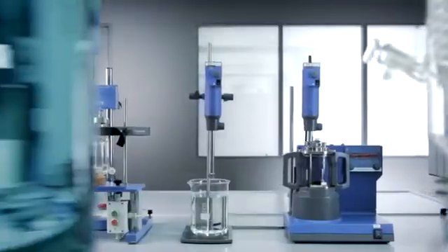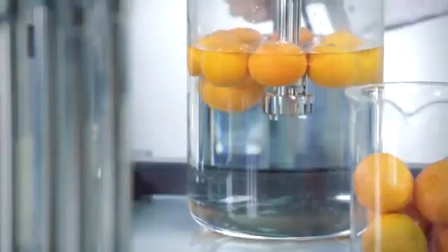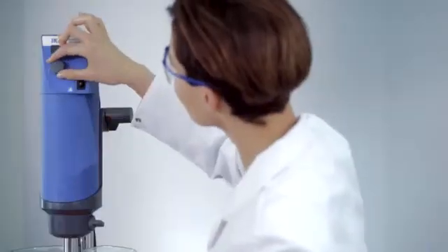The new T50 digital. Innovative modifications, now maintaining constant speeds even at higher viscosity levels. Safe and powerful with electronic overload protection.